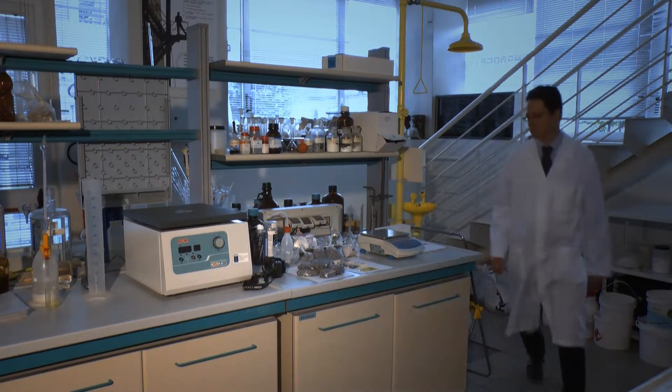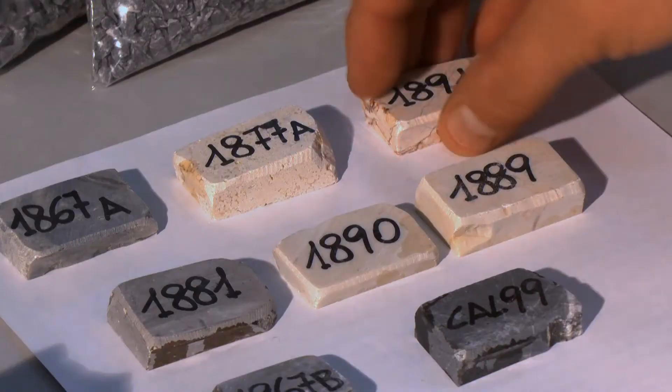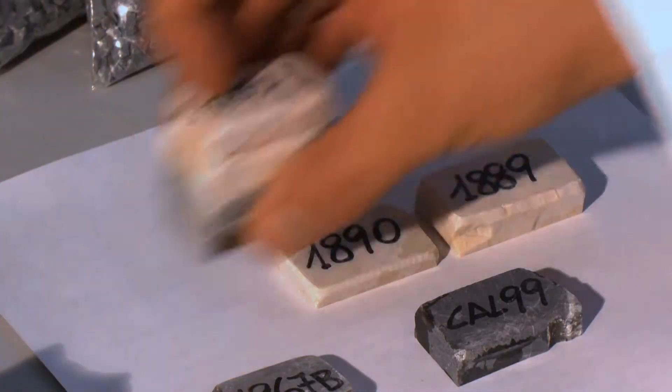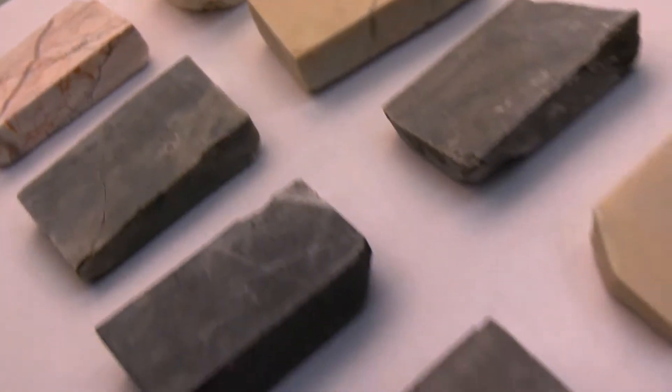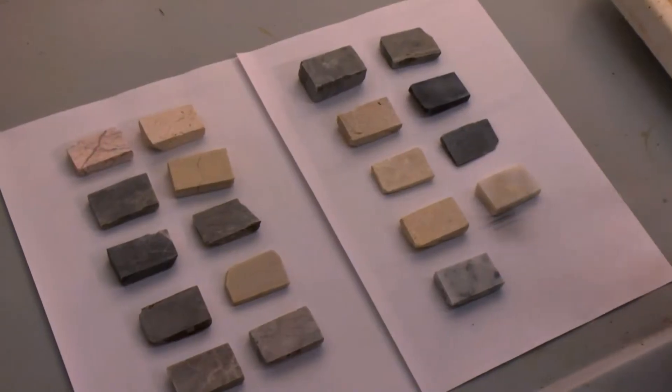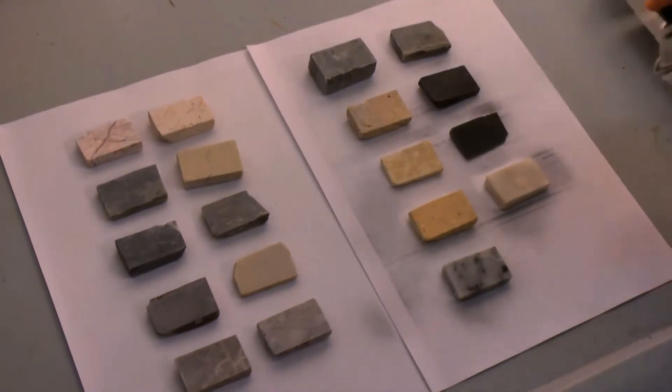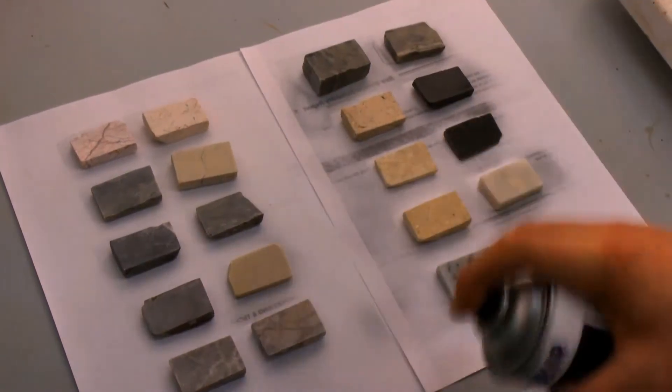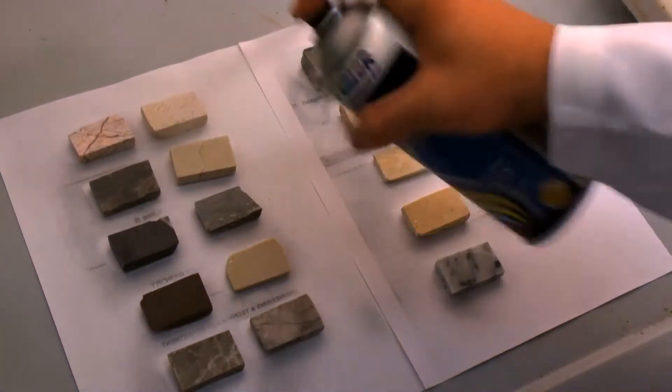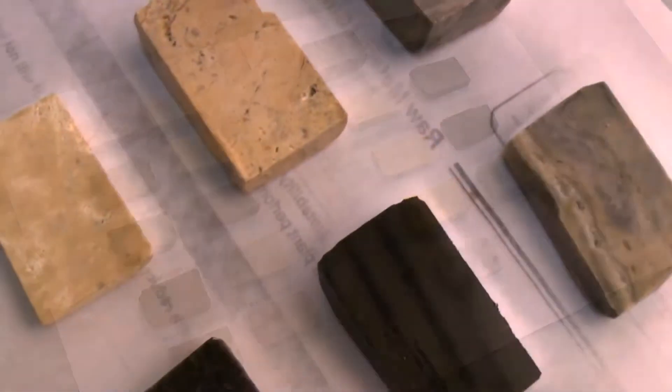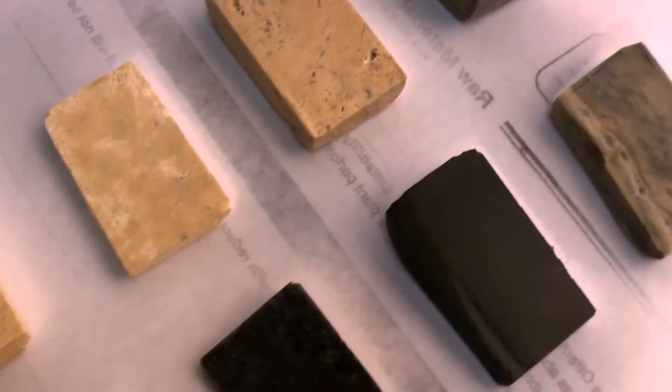Subsequently, samples are washed and cut with a diamond wire in the form of a prism of a standard dimension. Prisms of rock are polished using a glossy spray and macroscopic description is performed according to geological classifications.